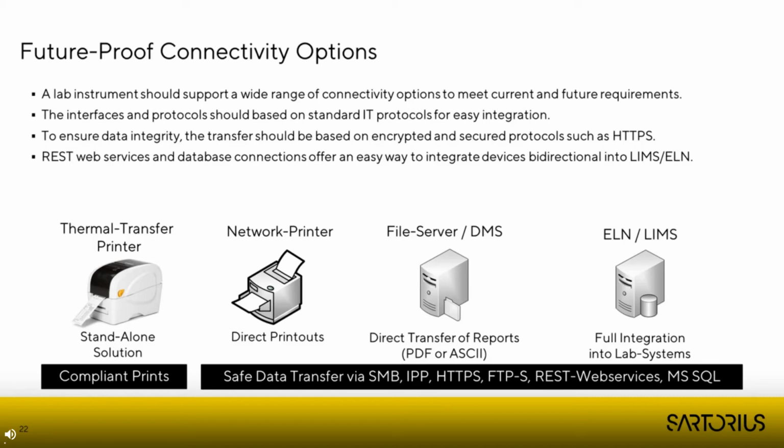And the other case is what we support with the balance, to make a direct connection to a database server, for example, a Microsoft SQL server, to store data or read data from this database server. And also we support REST web services. This is also an interface that can be used by many software systems to communicate with the balance, to read data from the balance, and to send data to the balance.